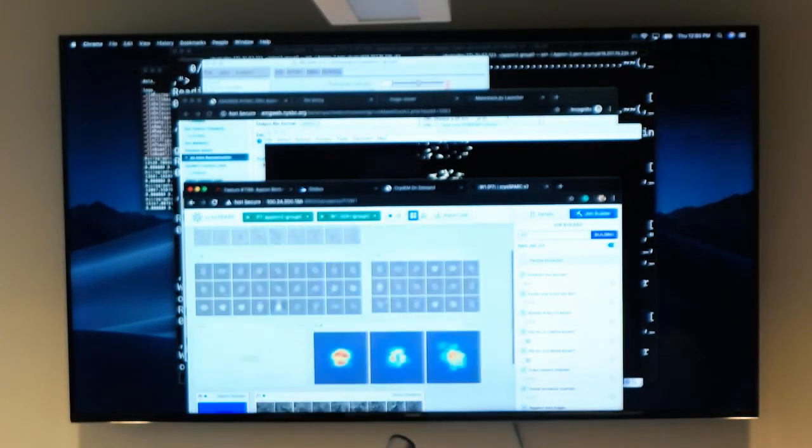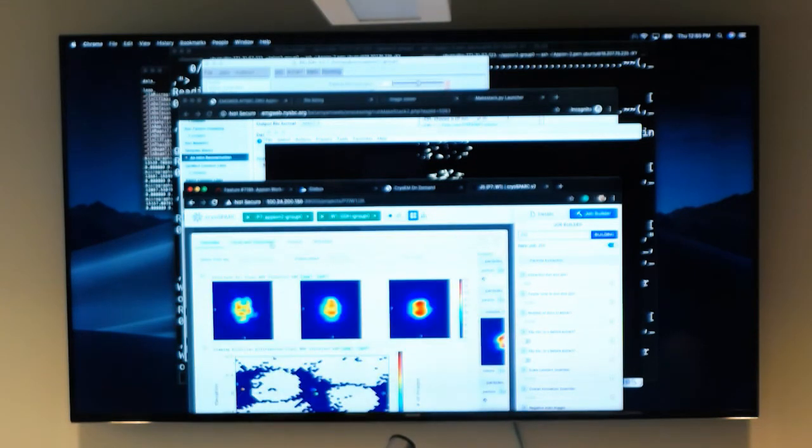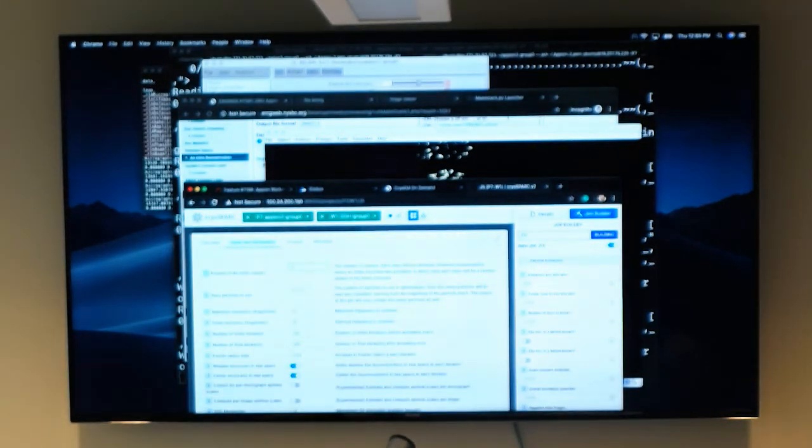How much am I affecting? Because you might say defaults are great, or you might say I want to actually change some of these. By what magnitude do you change that? You won't know until you start playing around. And so a test set is also helpful because we have a defined answer.